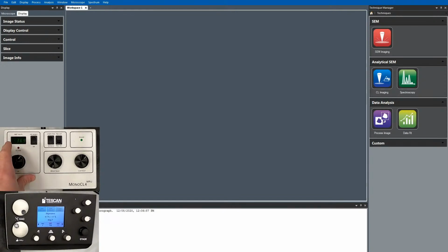This is a maximum voltage of negative 1500 volts. But what you'll find is if you go all the way up, this little LED will start to flash. It says HT trip. That means you're actually getting arcs inside the photomultiplier. So I'm going to start around 1200 volts, so not all the way up.